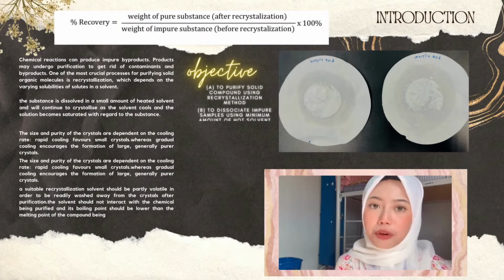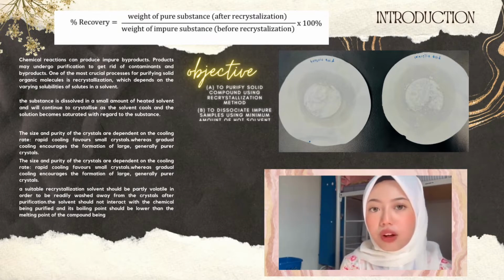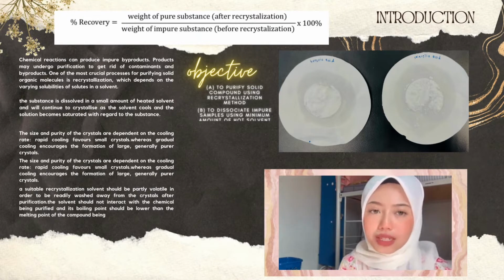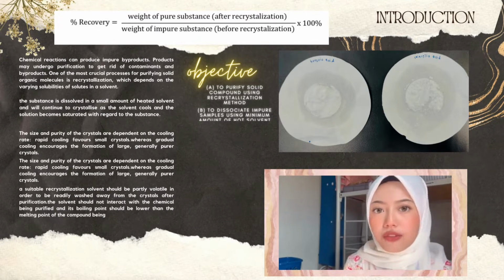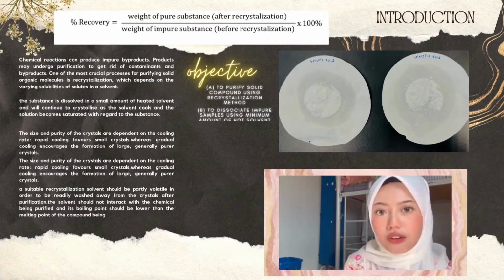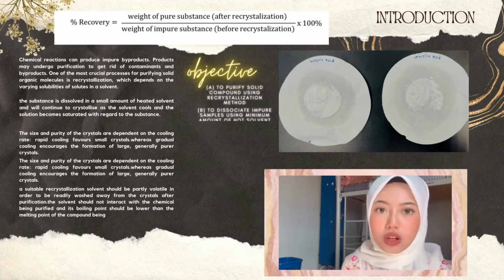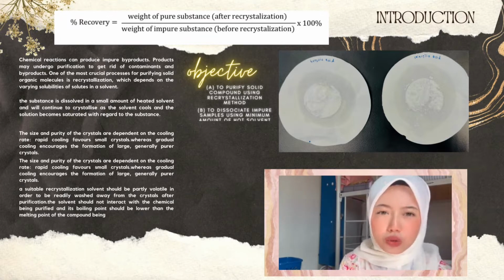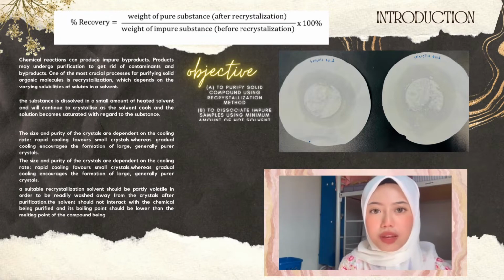A chemical reaction can produce impure byproducts. The product may undergo purification to get rid of contaminants and byproducts. One of the most crucial processes for purifying solid organic molecules is recrystallization, which depends on the varying solubilities of solutes in a solvent. The substance is dissolved in a small amount of hot solvent and will crystallize as the solvent cools and the solution becomes saturated with regard to the substance.